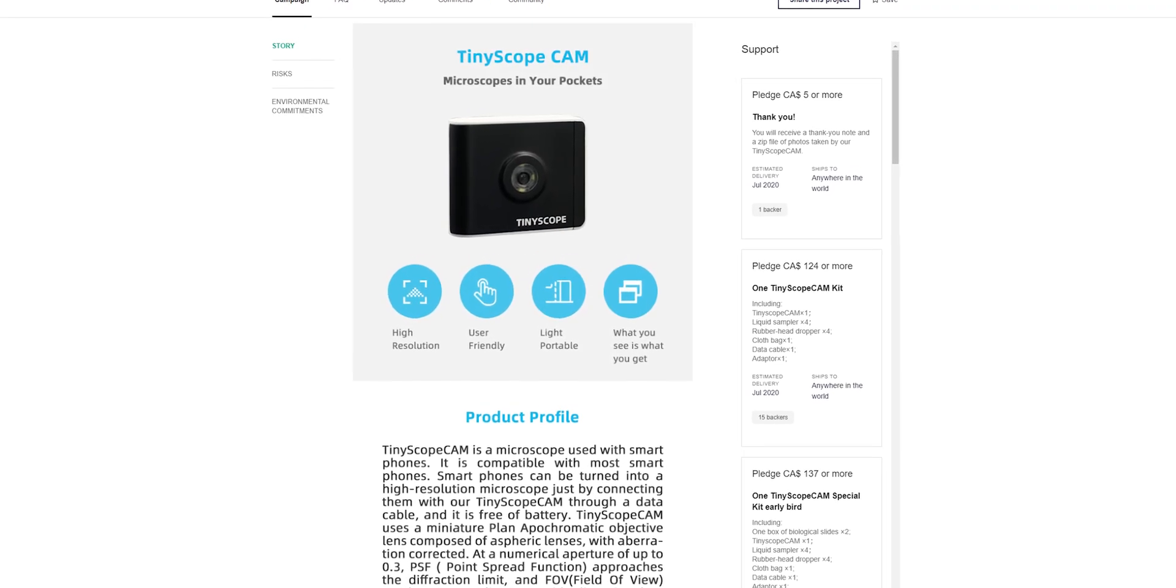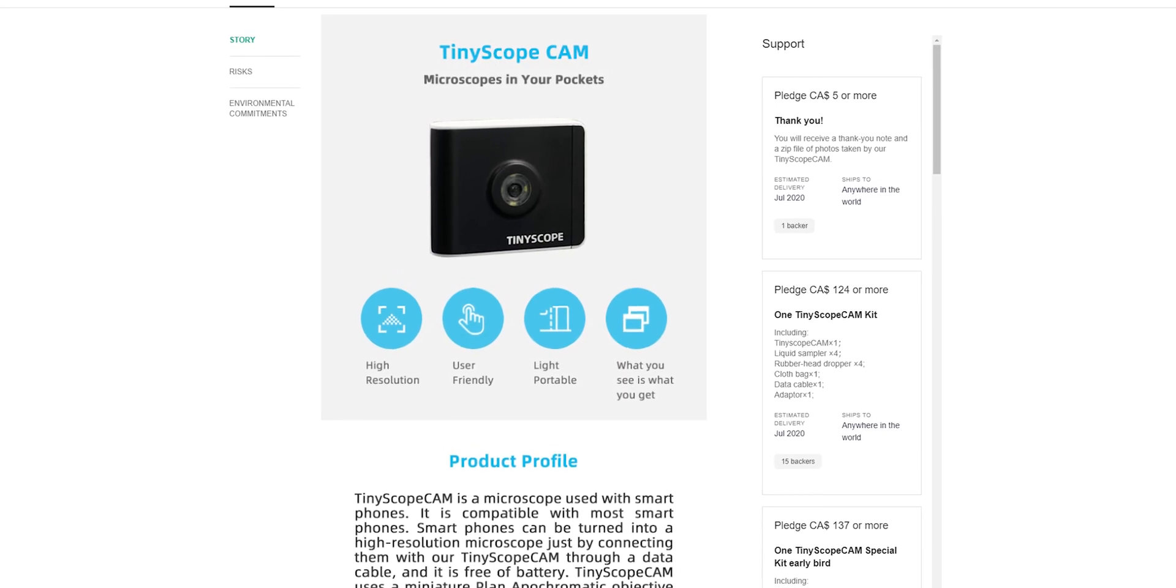And as you already can see I got their very first product and the reason they're just called TinyScope camera, because a couple of months ago they already had another crowdfunding campaign on Kickstarter for this little tiny scope I have here. It's also just a standalone camera but in the opposite direction, not a telescope but a microscope. And that's why today we're just taking a look at this really interesting approach. I have a couple of little items here we can take a really close look at and maybe decide if this is something really interesting you should probably get or is it just a niche product, so we'll just find out right after the intro.